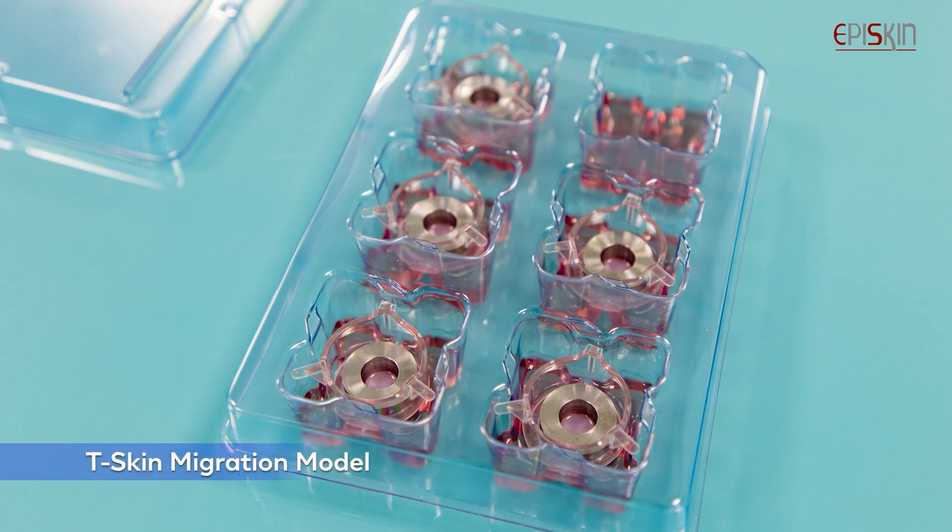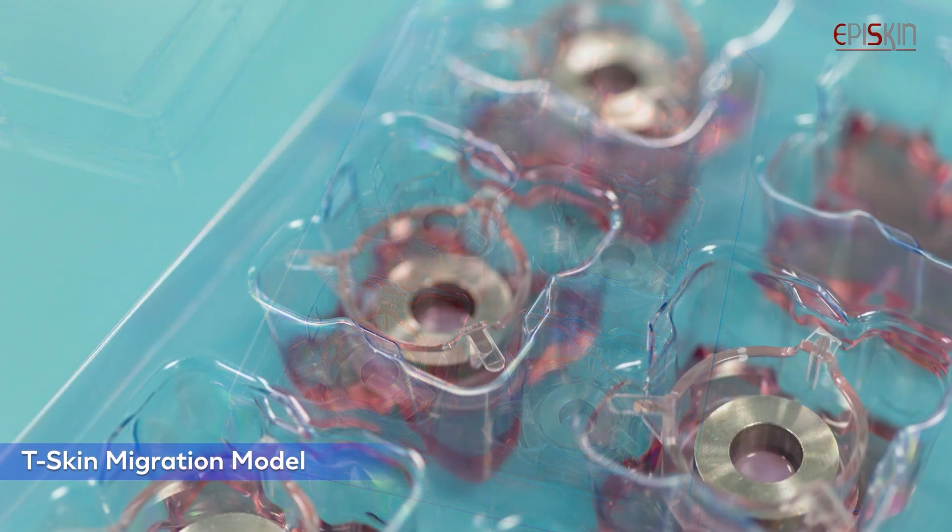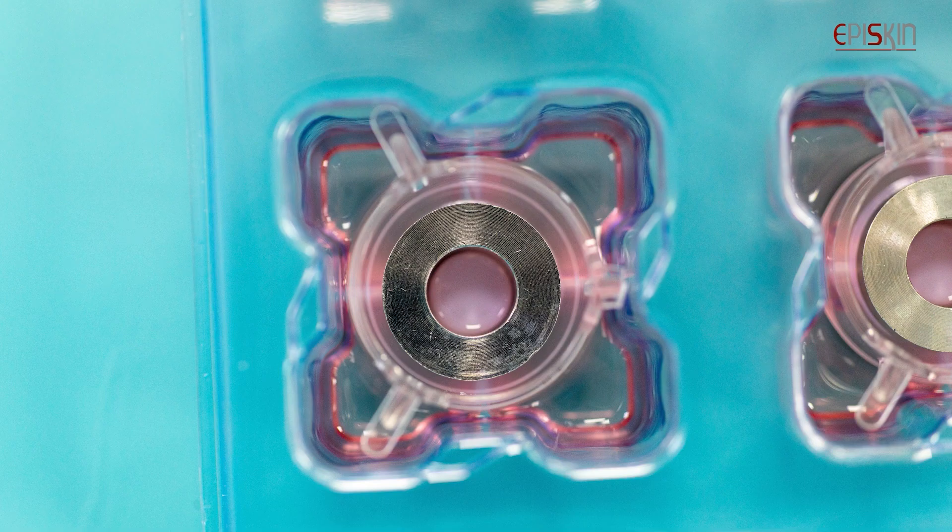The goal of the migration test is to observe the capacity of actives to improve the skin regeneration through a wound healing-like process based on the T-Skin technology.